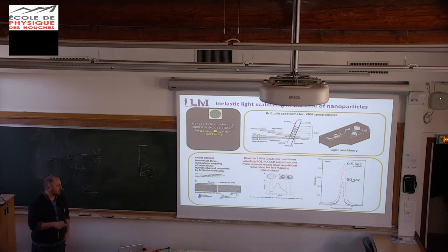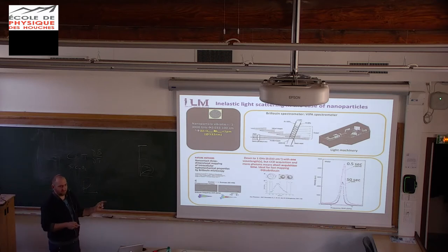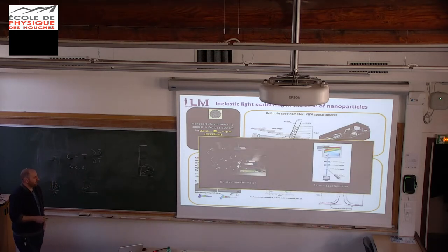This is interesting, because in that case what you're measuring is not only the sound velocity, but the index times the sound velocity. In the case of an eye, it's a lens, so you have an increase of the index and a decrease of the index. So it just checks that. Actually, they do things really better now. In my case, I will use both this tandem Fabry-Perot Brillouin spectrometer and Raman spectrometers.